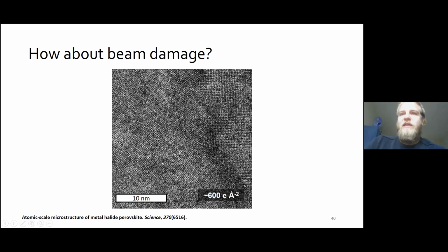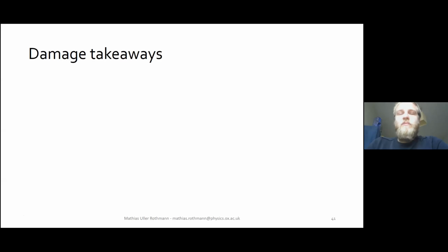Now, this is a very stable phase. This doesn't change a whole lot. So if you're scanning at 2000 electrons per square angstrom, you're not going to see a whole lot of change, which is really confusing because you're going to think that your material is super stable. And crystallographically, you could misconstrue this to being perovskite, if you're just looking at crystallography. So that makes it quite tricky.